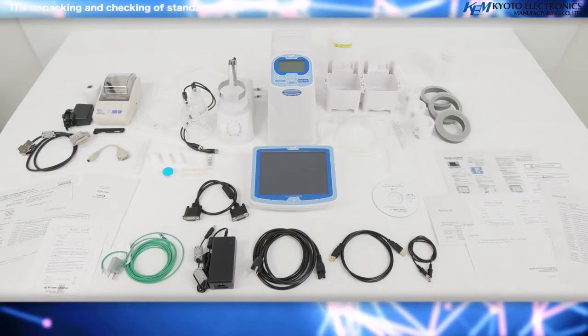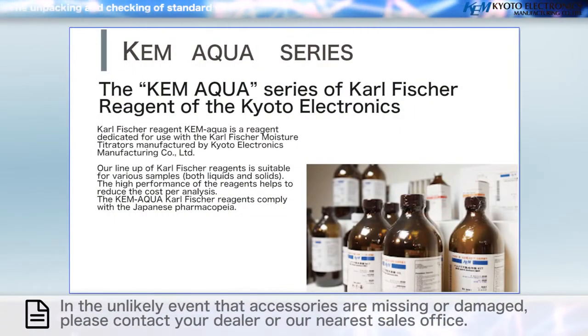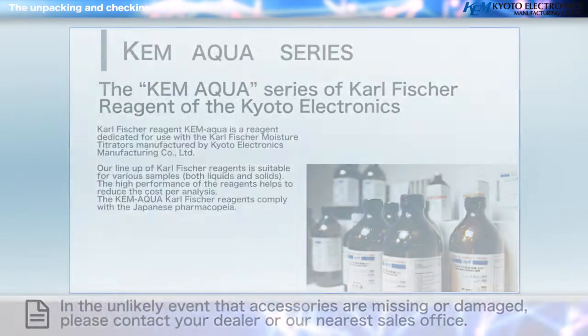The KEM Aqua Series reagent is a reagent dedicated to the Karl Fischer moisture titrator manufactured by Kyoto Electronics Manufacturing Company Limited.